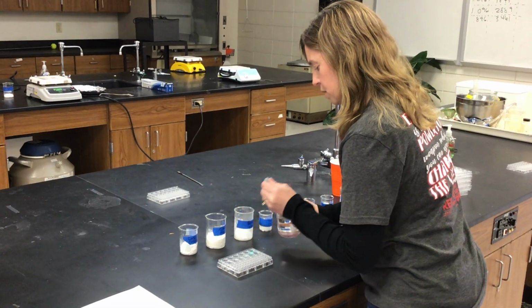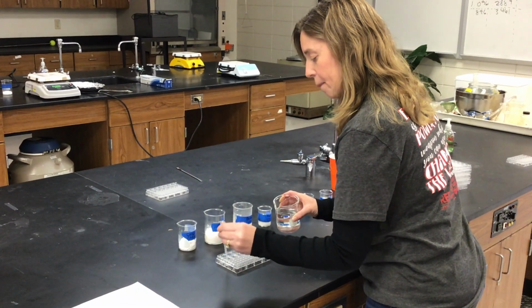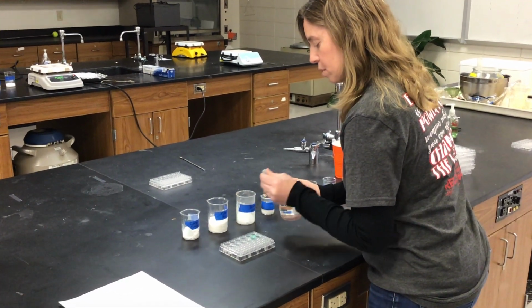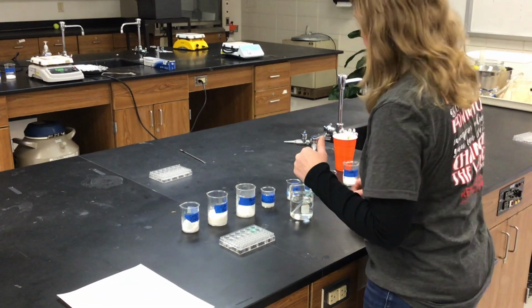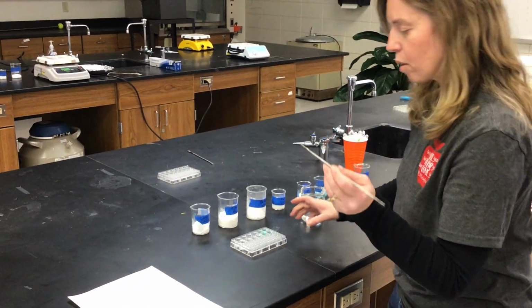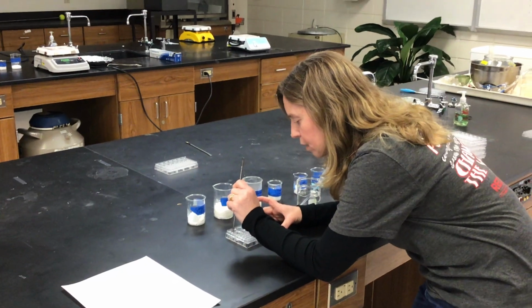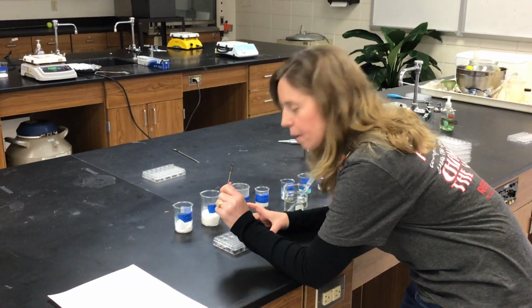Sometimes it takes a few minutes, and not all the particles will dissolve, but most of them. You want to check to see if most of them dissolve. So it's either going to be a yes or a no. Is it dissolved or not dissolved? So now I'm going to take this other part of my spatula, and I'm going to go ahead and stir these up a little bit.